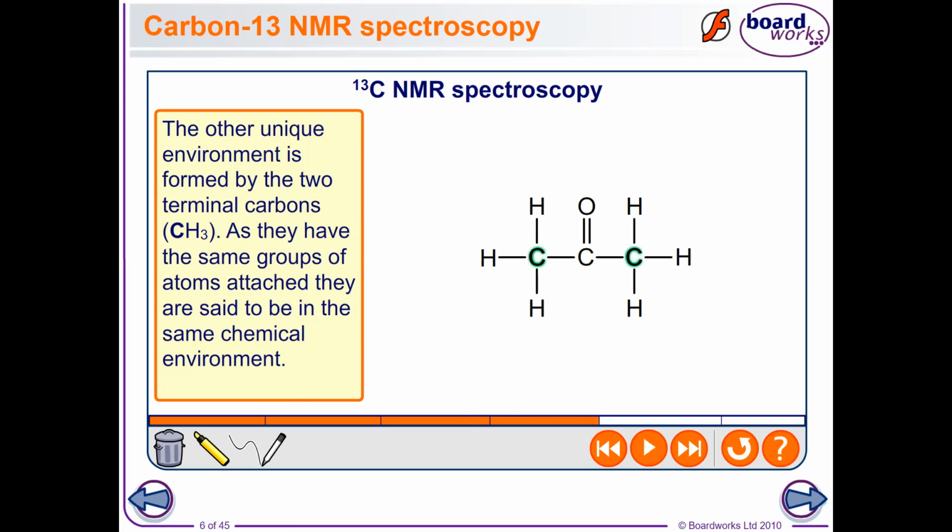Okay, so the next slide is going to show us the spectrum. We are going to see the spectrum actually goes kind of backwards. TMS is given a value of 0, but that 0 doesn't start where you'd think it starts. It starts at the high right-hand side of the spectrum. And then we measure the difference between that magnetic field and the ones that these nuclei are experiencing. And they chemically shift downfield, so they will move to the left of that.